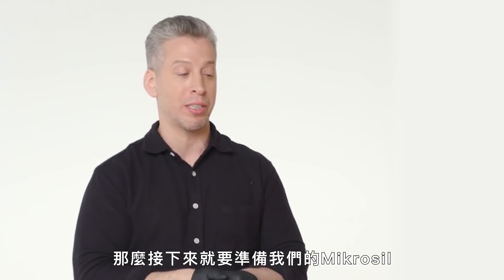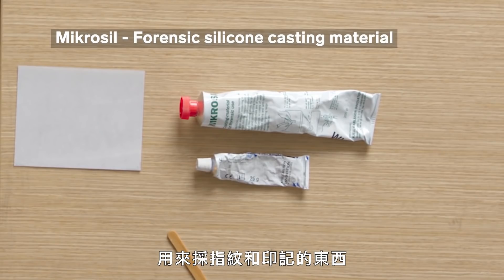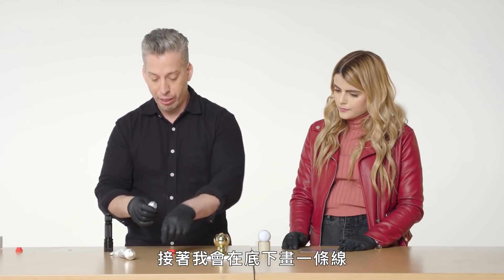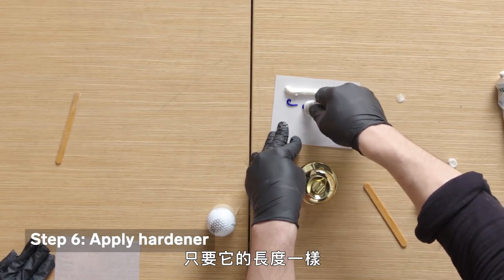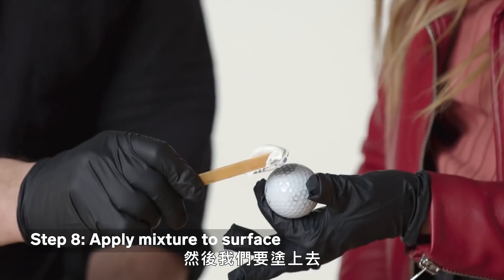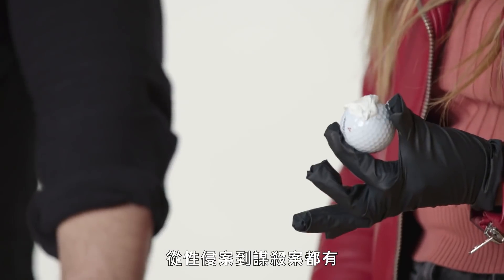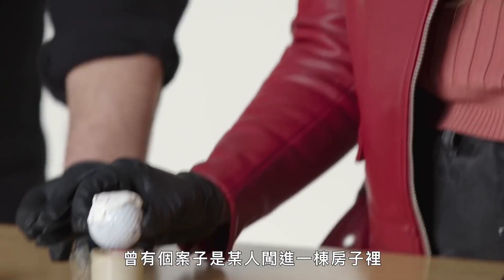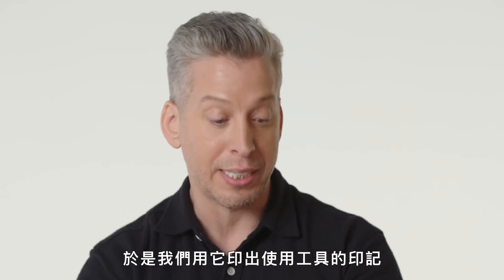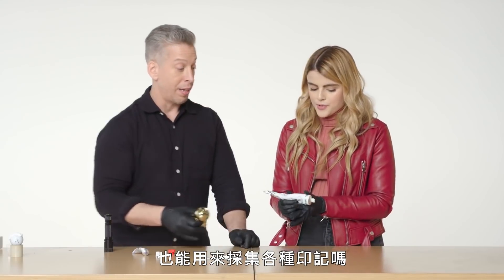So the next step is to prepare our Microsil and apply it to the surface. Microsil is a casting component we use to recover fingerprints or impressions from difficult surfaces. I'll draw a line of the base component from one side of the card to the other, then draw a line of the hardener just below it. Mix the blue into the white, scoop up some Microsil, and spread it over just like you would spackle a hole. I've used this in everything from sexual assaults to homicides — I had a case where someone broke in and left a tool mark impression from a screwdriver, and we cast that impression. You can use this not only for fingerprints but for other sorts of impressions as well.